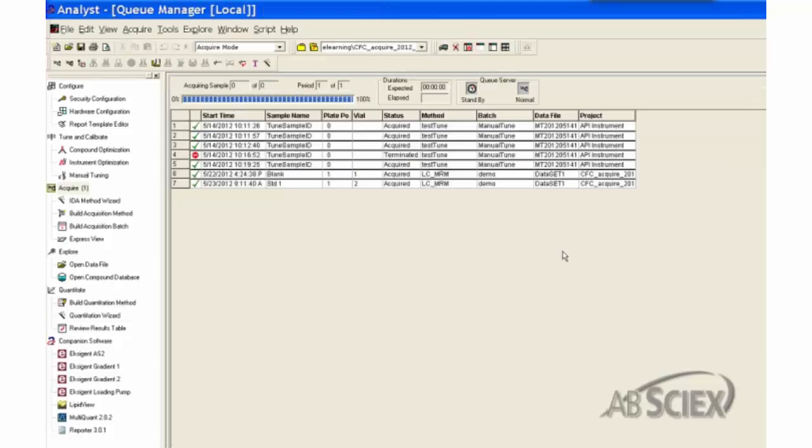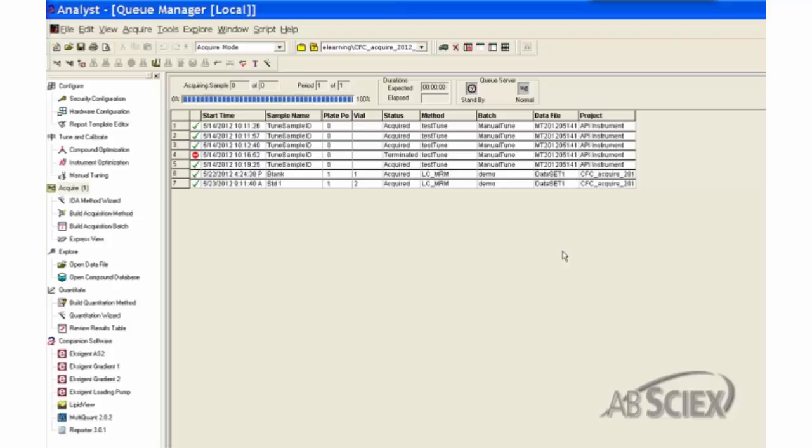In Analyst, to equilibrate the system or submit samples for analysis, the sample queue must be opened. The sample queue not only monitors the instrument status and the real-time sample analysis status, but also records the sample submission and analysis history.